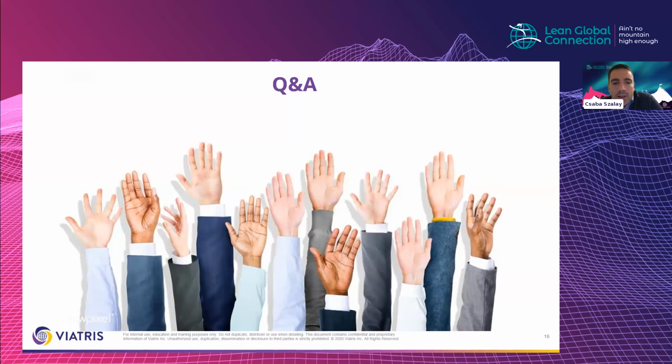And the next question is, what was the biggest difficulty in implementing? Oliver: It was several difficulties, especially from the very experienced colleagues who believe that they can perfectly do everything. So they said, I don't need this. This is just stupidity. Why do I need to learn? And we tried to solve this problem: if you don't have any human-related investigation, we won't teach this technique because you are perfect. But if you have, in this case, you will get such training because something went wrong, and we believe that you can learn about this technique. So it was the first point, which was not so easy.